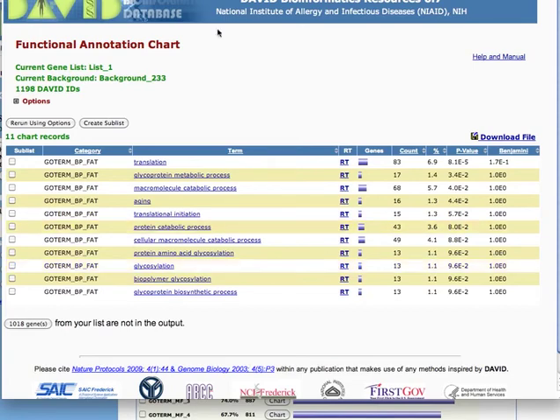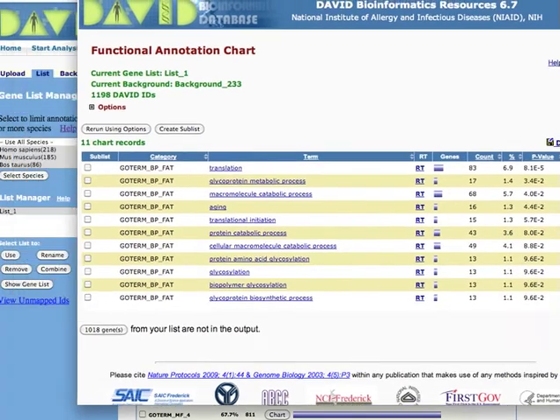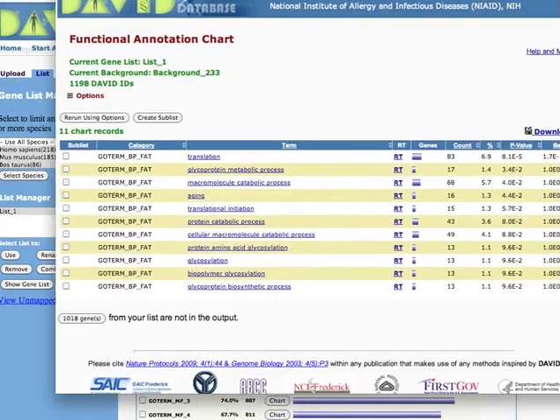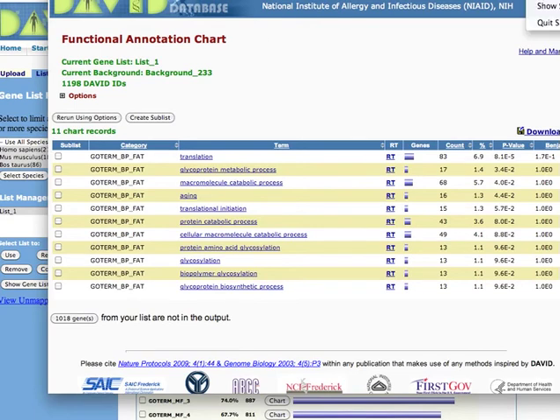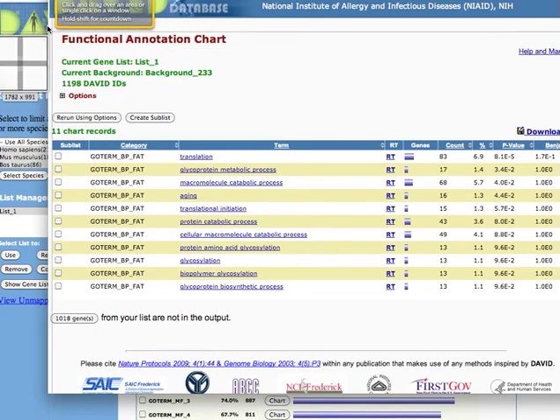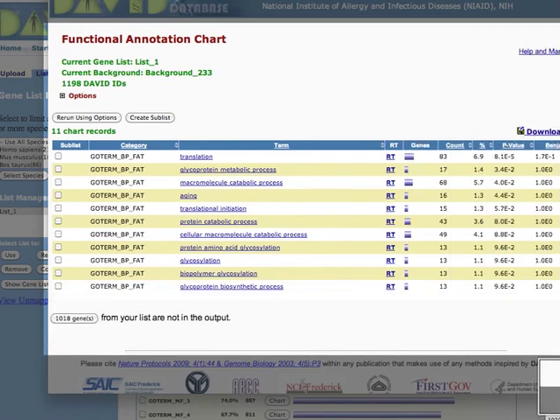So what we have to do now is we've got to capture all of this data as best we can because it doesn't save.